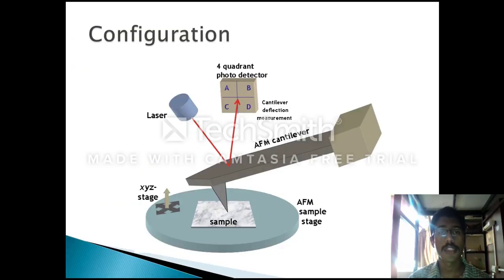First, let's see how it's made. The atomic force microscope has a major component which is called the cantilever. The cantilever is a horizontal rod pivoted at a joint which can oscillate back and forth. There is a tip connected to the cantilever which is responsible for moving over the sample. A laser gives out an incident beam on top of the surface of the cantilever, and a detector detects the reflected beam from the surface.